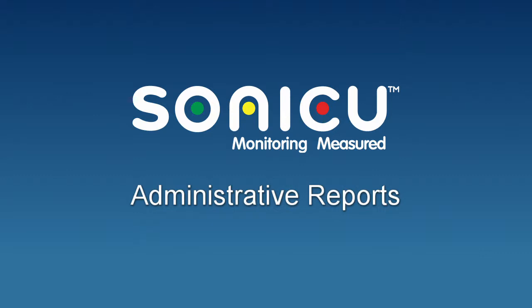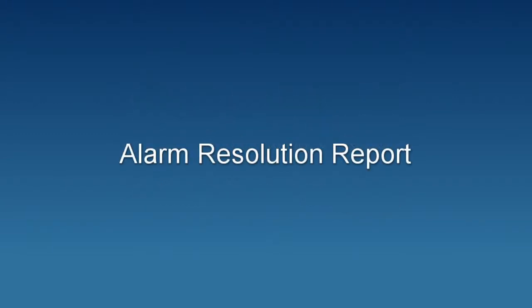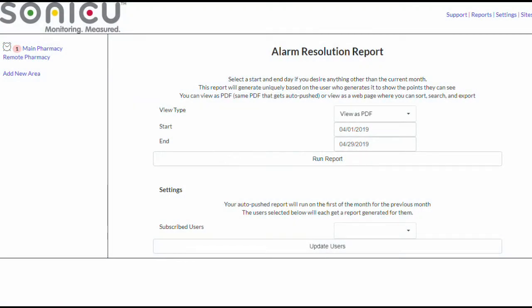Beyond the basic reports, Sonicu also provides users with reports that help you manage your site and its users. Alarm Resolution Report. After selecting it from the Reports menu, choose the start and end dates for the report and then Run Report.